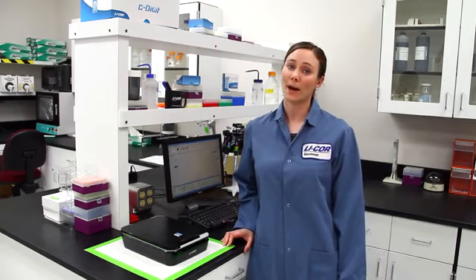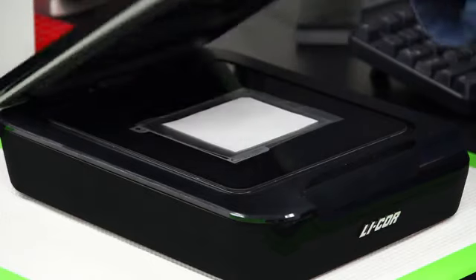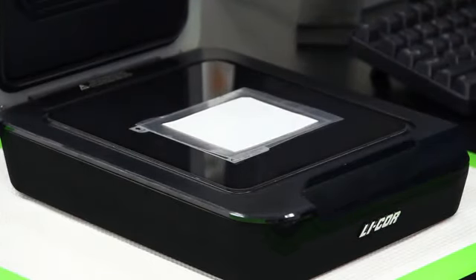Just like during film exposure, make sure that the membrane remains wet while scanning on the C-Digit. You can either wrap it in plastic or place the substrate right on the scanning surface. And remember, the blot goes protein side down on the C-Digit.